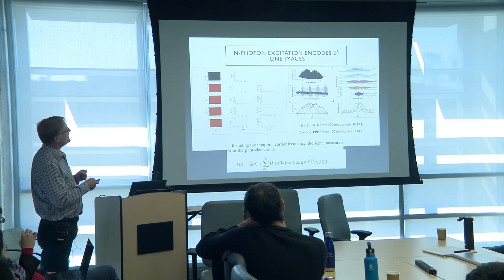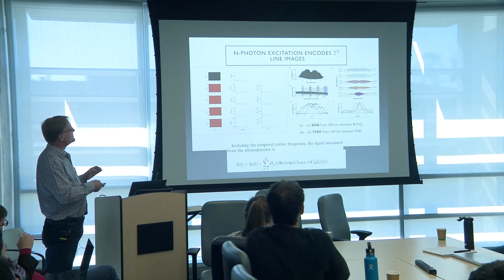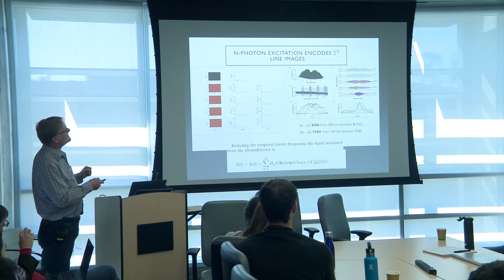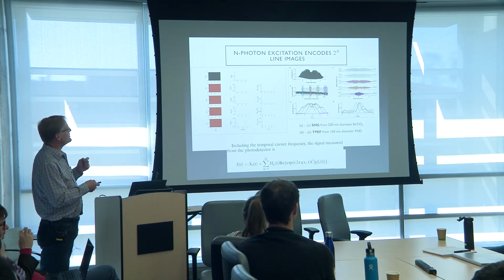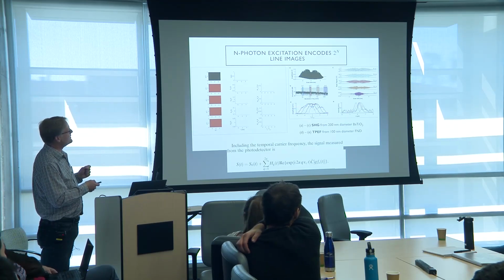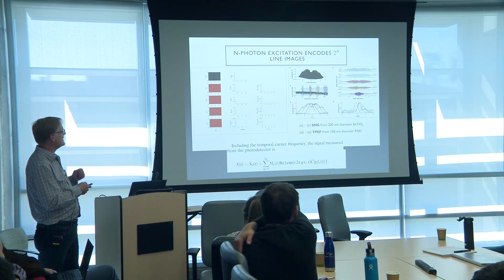We can take the Fourier transform of it, and you see all these different images at all the different orders here. We can isolate each one and go back into the time domain. We're able to watch and measure, based on this, the individual cutoff frequencies for the system and actually the point spread function. And this is our very first data.